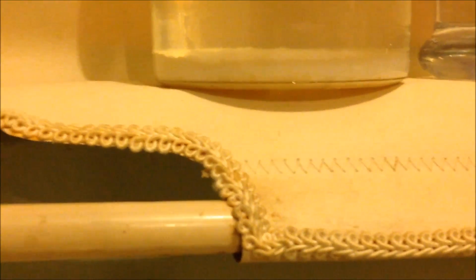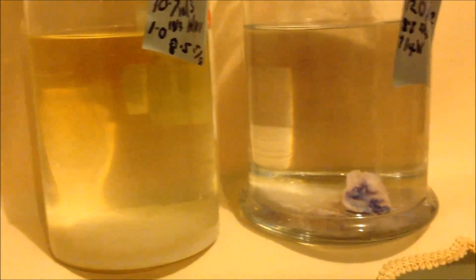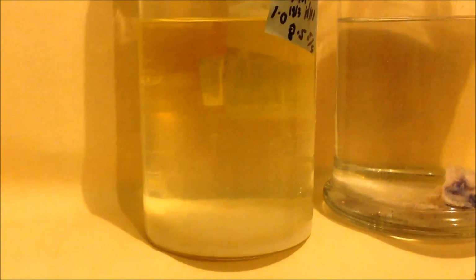And this was our main jar. You can see there's not a lot of precipitate there, which is the goal, was to reduce the amount of magnesium hydroxide coming out of that solution. So our goal is to do a third stage precipitate by taking this down to pH 1 and coming back again.